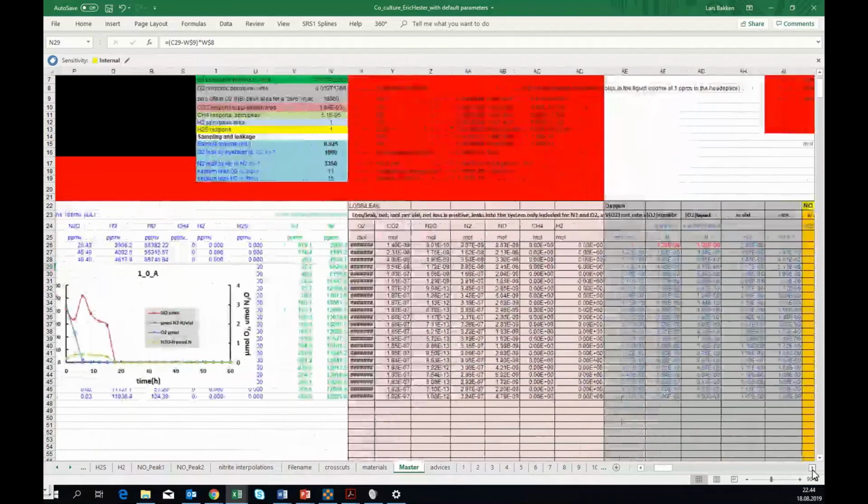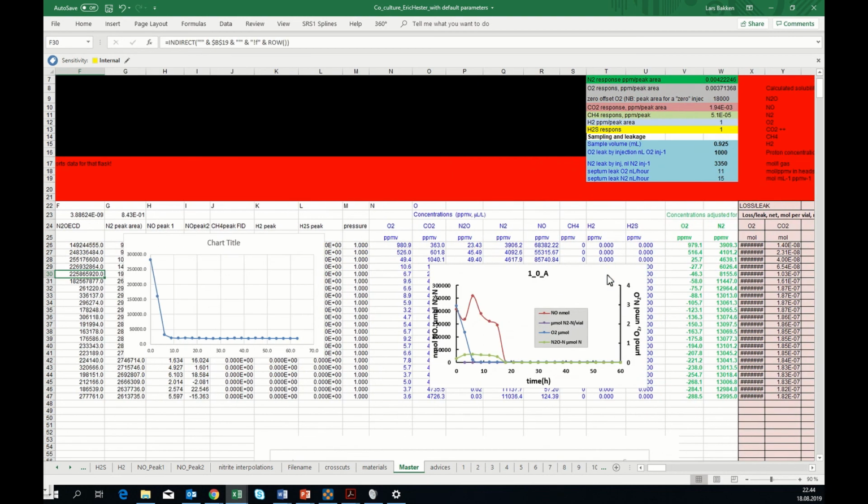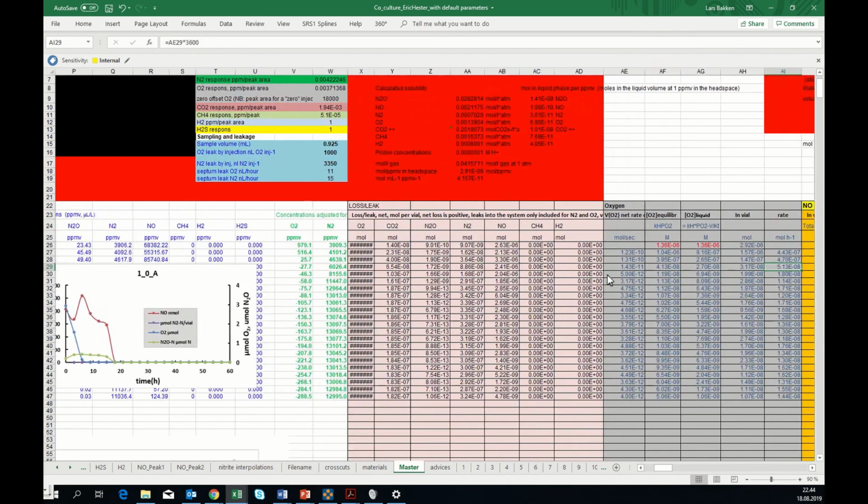If you look over here and look at what it means in terms of concentrations, if we go into this table here, the concentration is 27 nanomolar. So it's definitely an extremely low oxygen concentration, so it's acceptable, and we have to live with this.